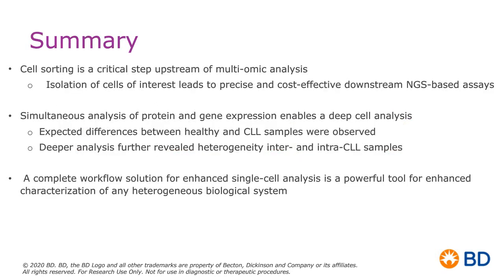Okay, so in summary, I hope you appreciate the value of the ease of these workflows when we put them all together, going from your sample to answer, and how critical it is often to think about what are the populations that I'm interested in, and then enriching for those particular cells, because you really want the most precise and cost-effective approach when you're performing these assays.